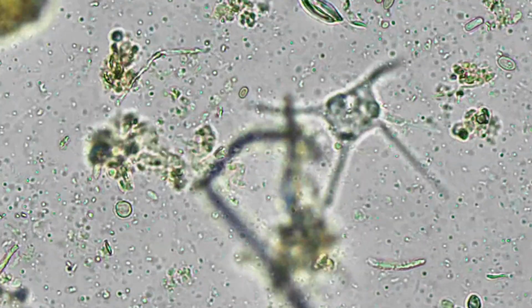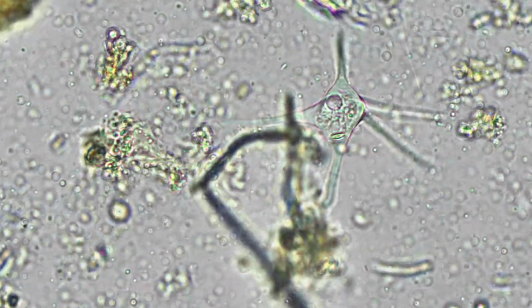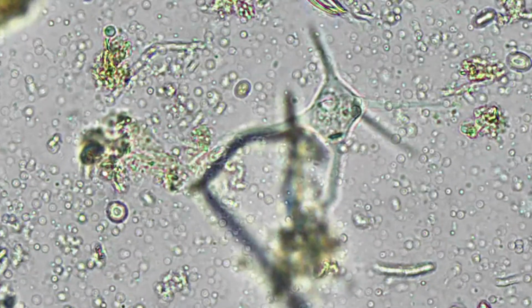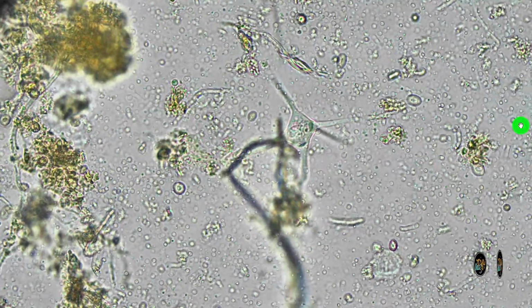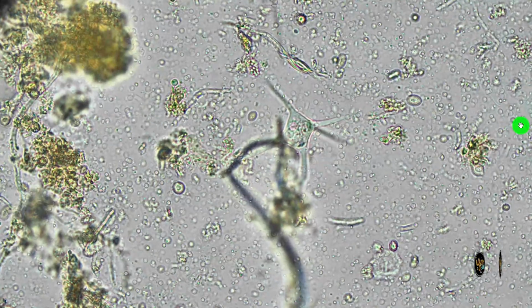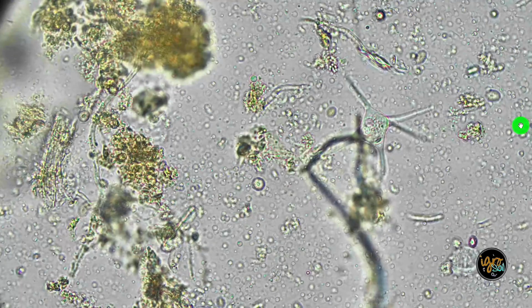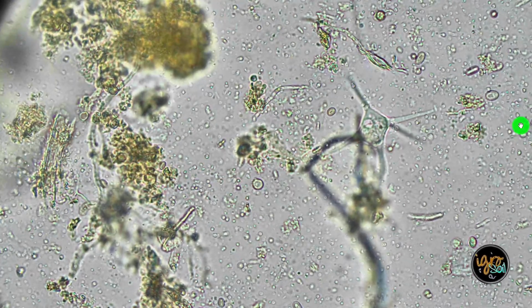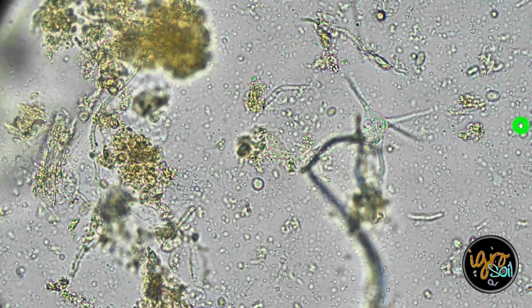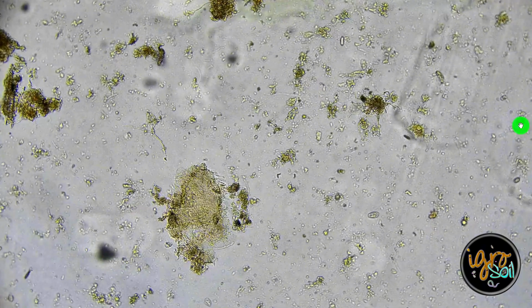Is it eating something? They usually wrap their bodies around, like starfish. I've seen some star amoeba will wrap their bodies around things, like starfish do. That's a cool find. That's a cool shot. I dig that. And let's keep pushing to the end of the slide.